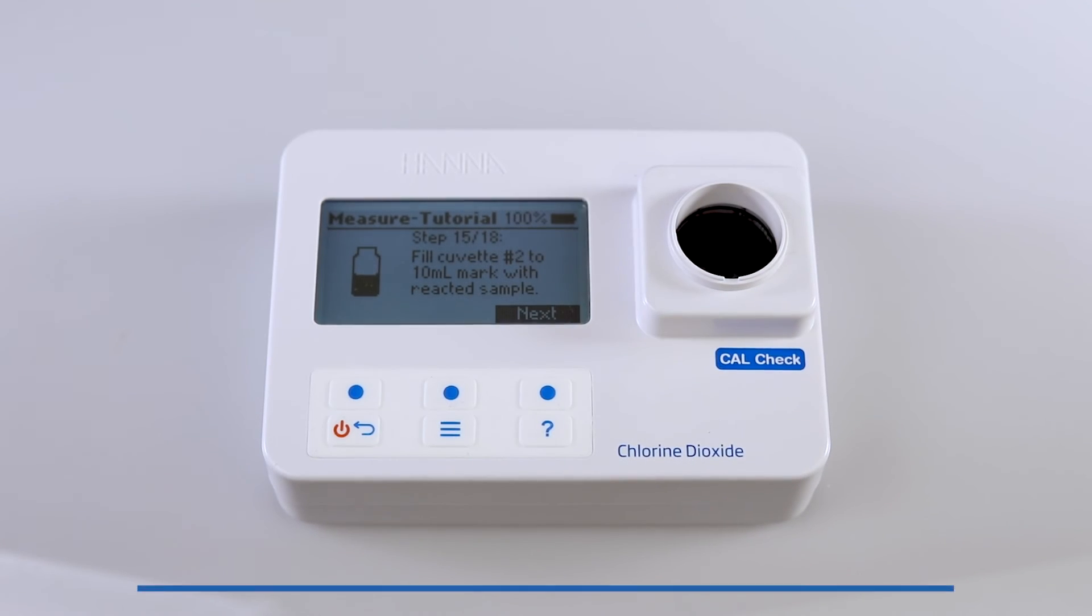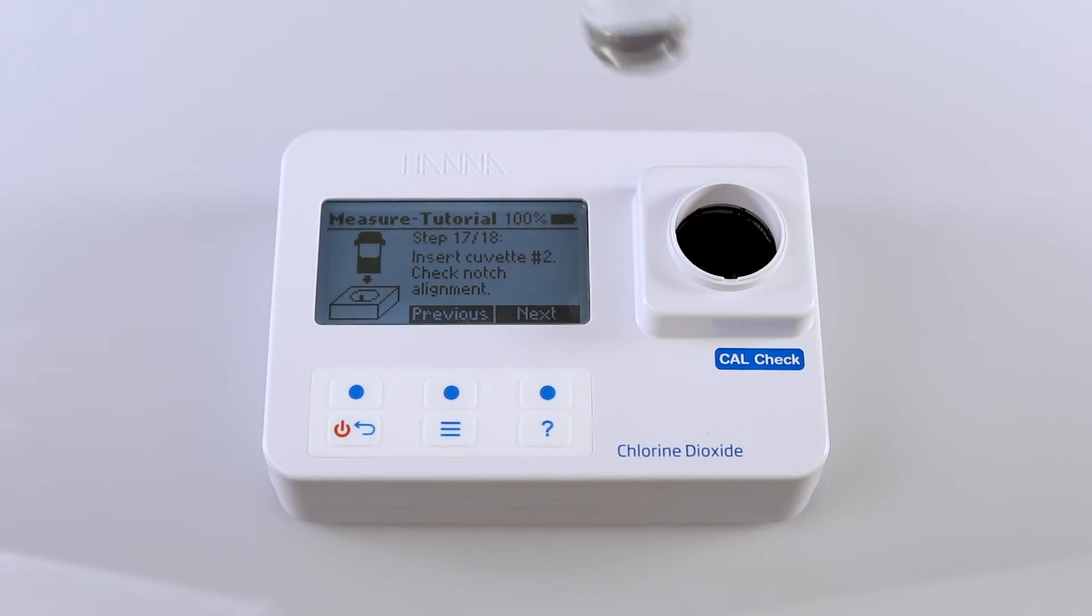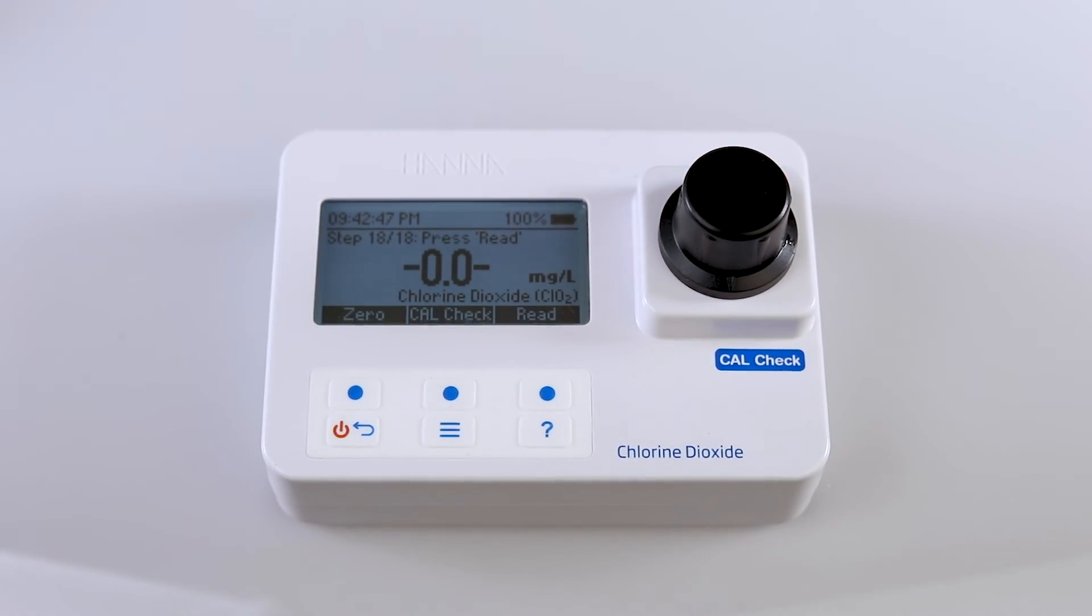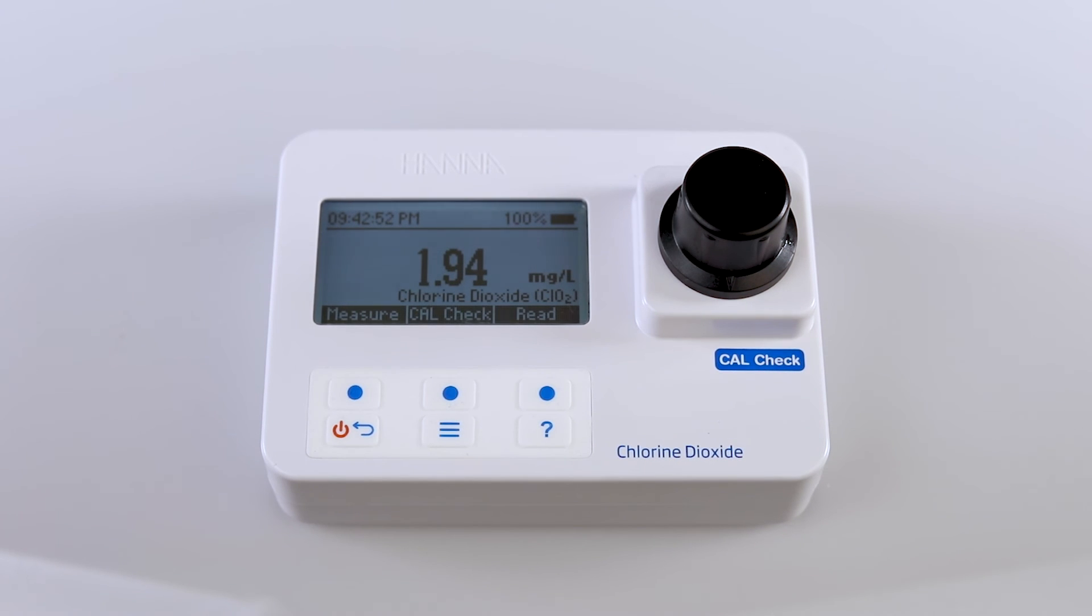Next, fill your second cuvette to the 10 milliliter mark with your reacted sample. Replace the stopper and cap, wipe the cuvette, and insert the cuvette into the holder. Press read to start the reading. The instrument will display the results in milligrams per liter of chlorine dioxide.